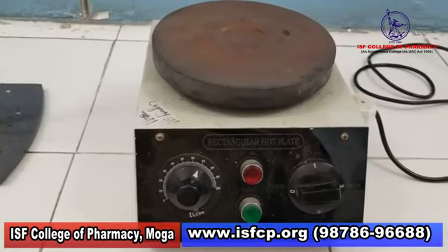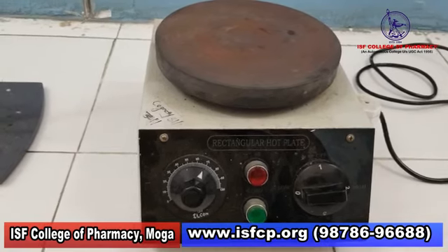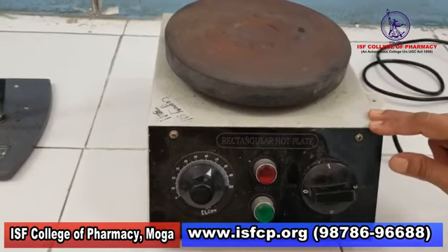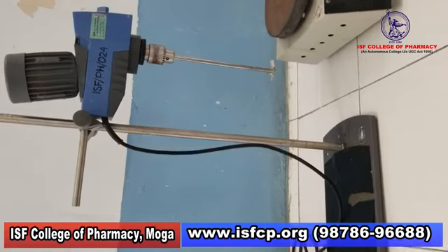After segregation of the ingredients, let us see the equipment required for the preparation of the cream: the temperature controlled hot plate and the speed controlled mechanical stirrer. These are the two main instruments required.